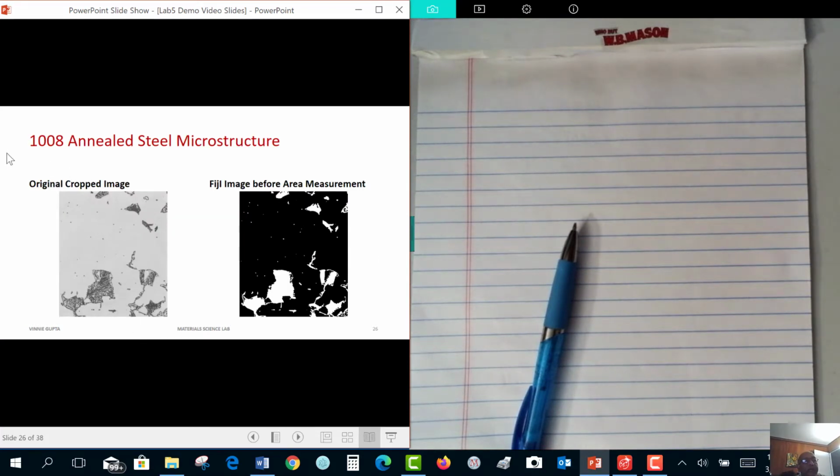So I have a 1008 annealed steel microstructure. Let me open this image.